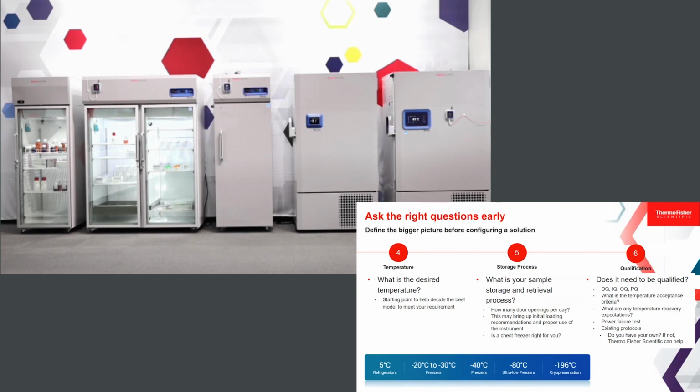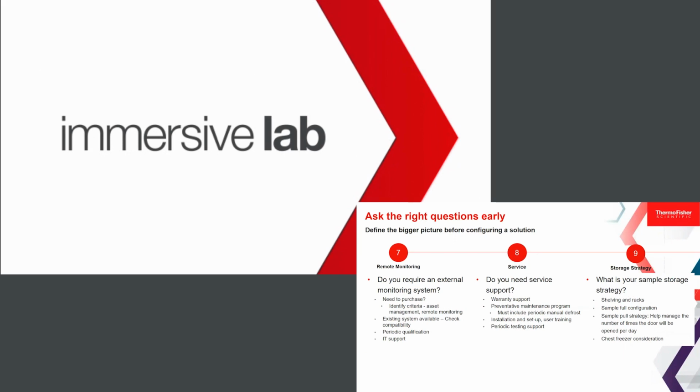Certainly we have all of the resources available for each model that we offer on the variance at each probe placement within the unit. So think about what your samples need as far as the variation or tolerance. And then if you need help, we certainly have the Unity Lab Services team that can help you with that compliance portion. Next, we're going to shift into remote monitoring.